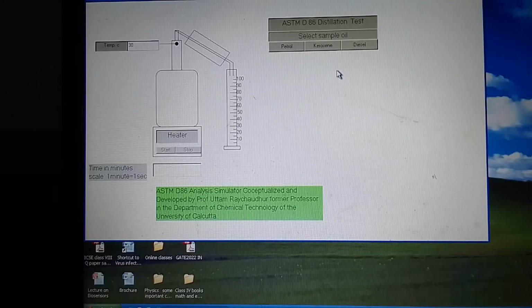So those who are using this petroleum testing have some idea about how this is the simplest and cheapest method of testing the quality of products like these petroleum products.